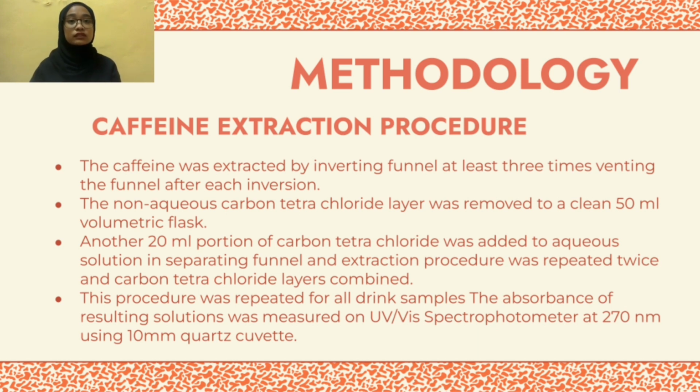This procedure was repeated for all drink samples and the absorbance of the resulting solution was measured on the UV spectrophotometer at 270 nanometer using a 10 mm quartz cuvette.